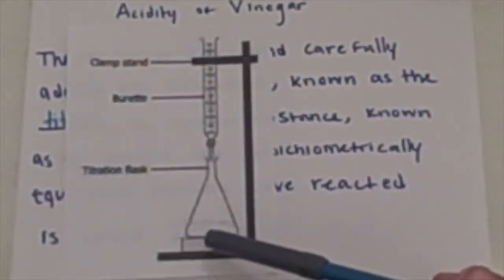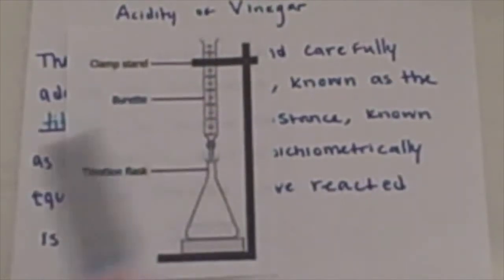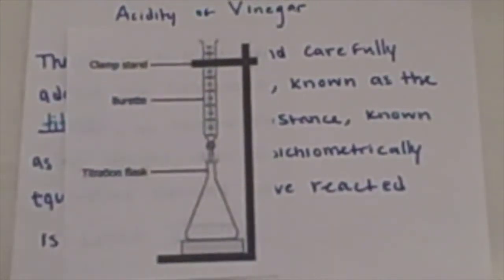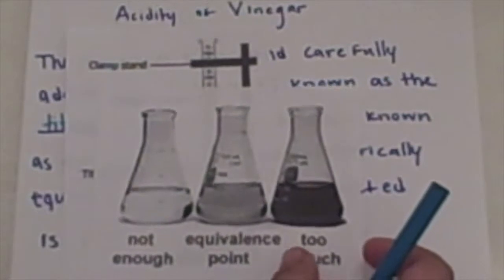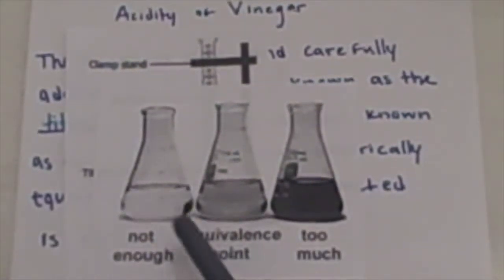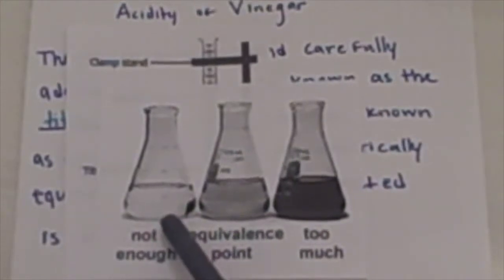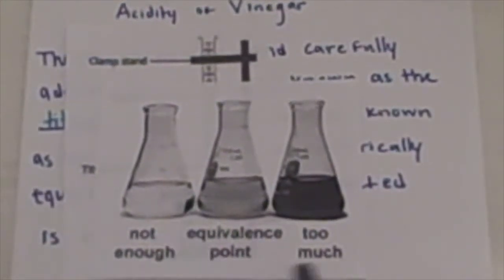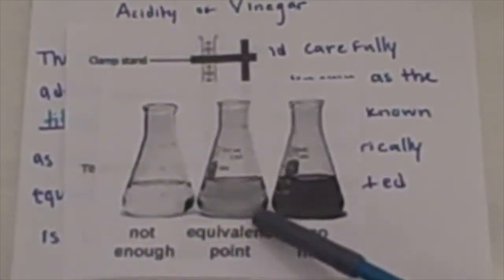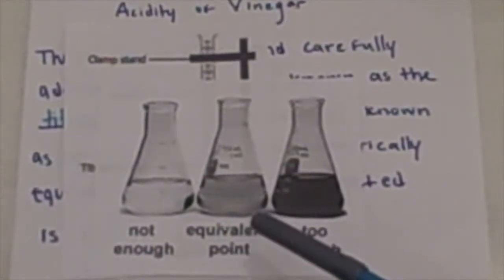The titrant is added to the sample until an indicator changes the color. So here's what it looks like. This is when you're adding the titrant. There's no color change here. But then once you reach the equivalence point, you see it getting pink. So it should be a light color. That's when you stop.